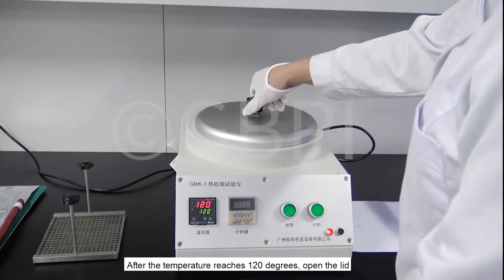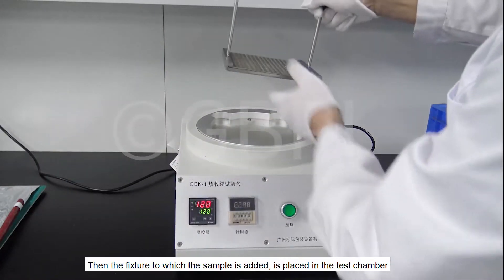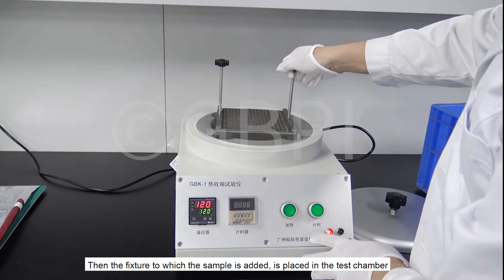After the temperature reaches 120 degrees, open the lid. Then place the fixture with the sample into the test chamber.